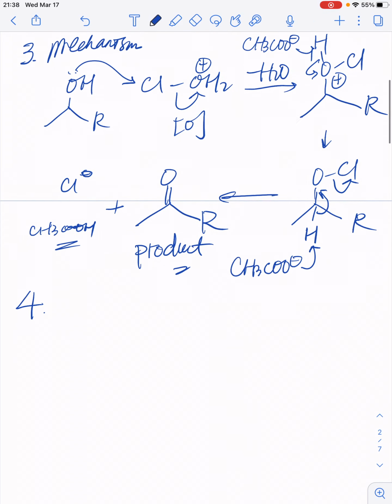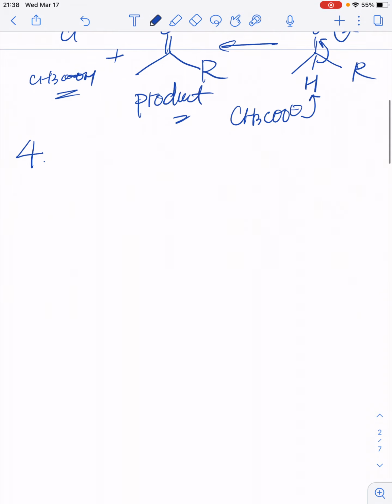The next thing we're going to talk about is something we used this week for testing. We used KI starch paper twice. And why do we use that in the first place? How does it work? To figure that out, you will need to know what's happening during the KI starch paper testing process.